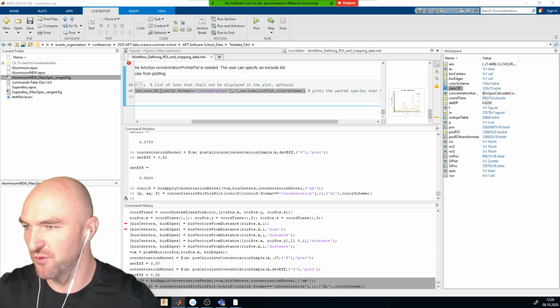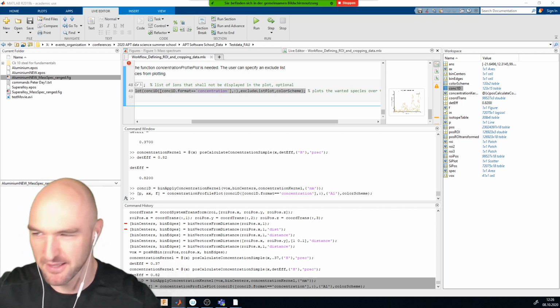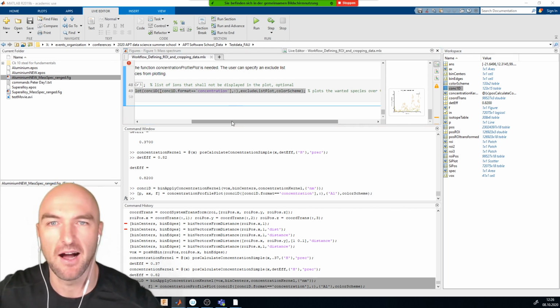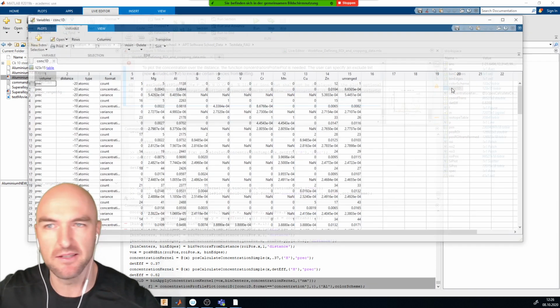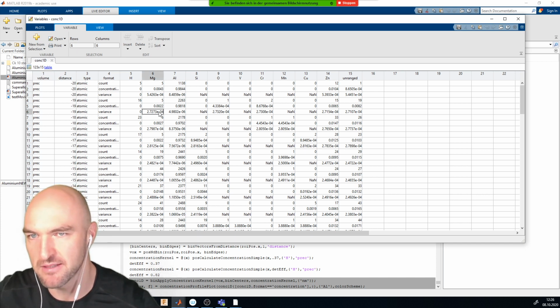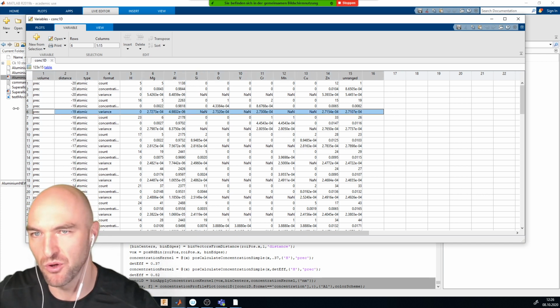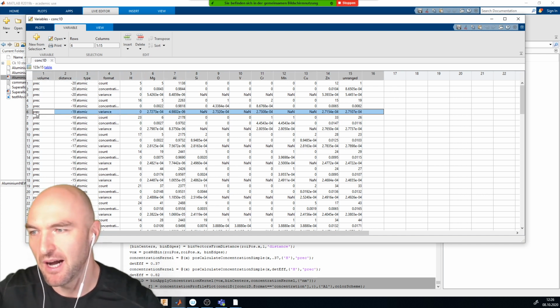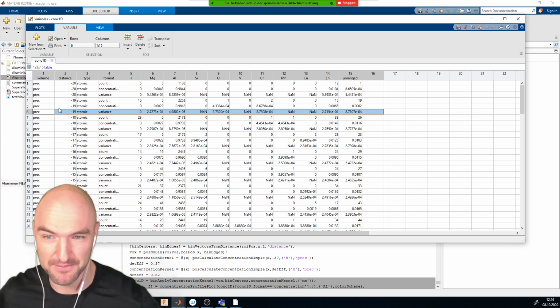Does the concentration profile plot come with an error bar function built in? I forgot if we did that. The reason why I haven't... I believe, I'm not 100% sure whether we did that, but what I am 100% sure about is that we have included the variance, which is usually used to calculate as the counting error. That is definitely included.